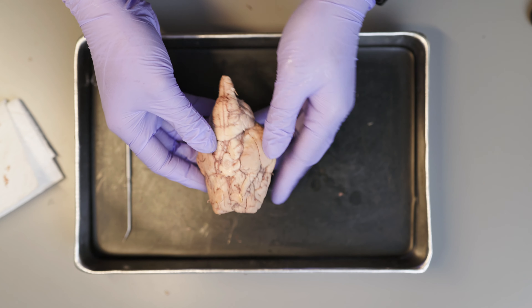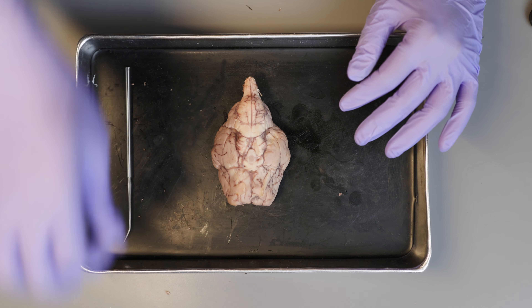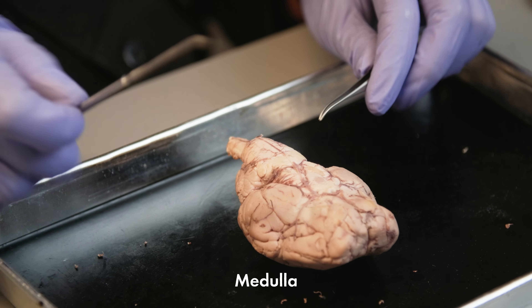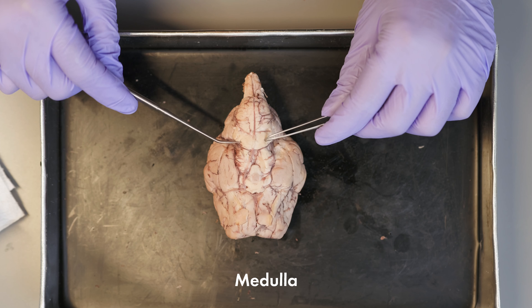I am going to place the brain on the tray with the ventral surface, or the bottom side, facing up. Here you will find the medulla, that contains the centers for heart rate, blood pressure, and respiration.